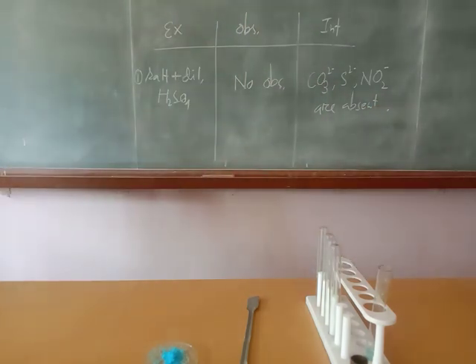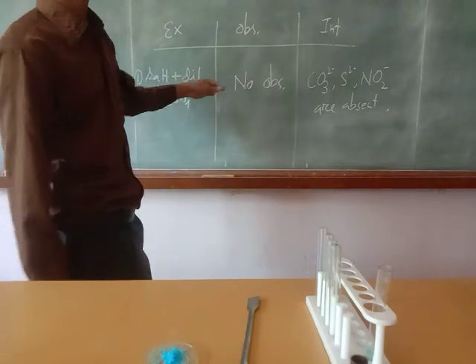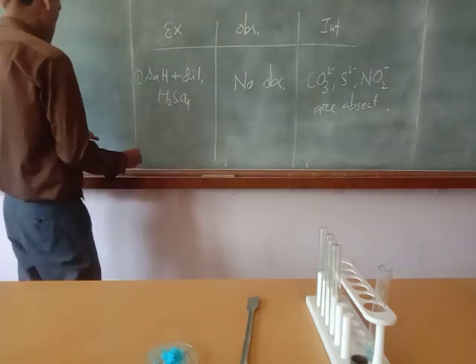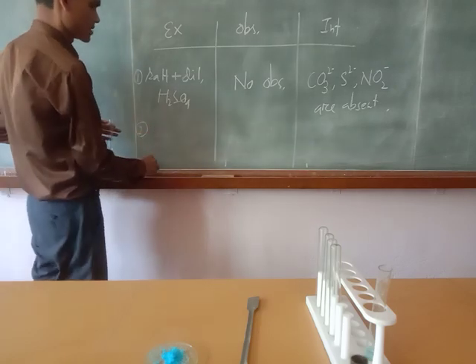So our dilute sulfuric acid test is completed. If you observe nothing in dilute sulfuric acid test, then you have to proceed to the next step, which is concentrated sulfuric acid test.